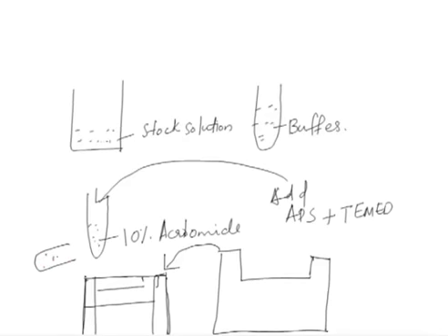Now, what will happen? This material has to be poured in here. So, you will pour your material in here, and you have to be very careful: you will be pouring this through the walls.